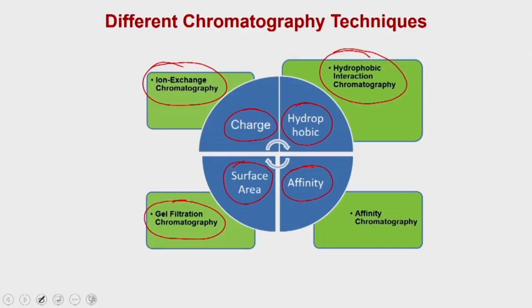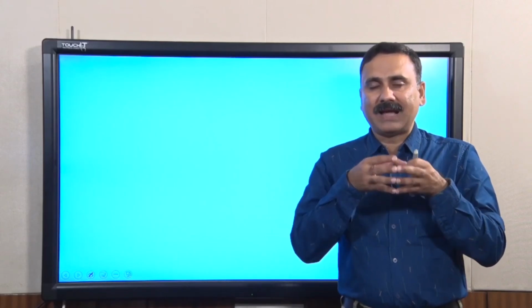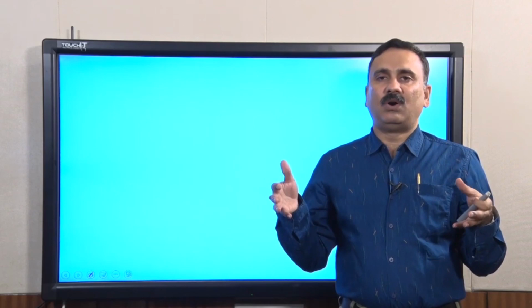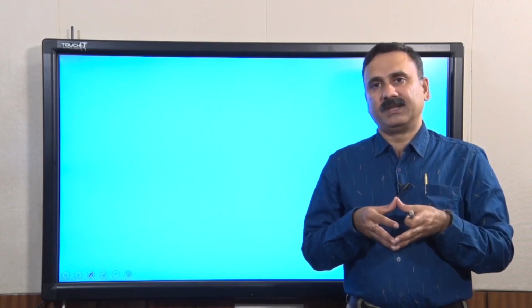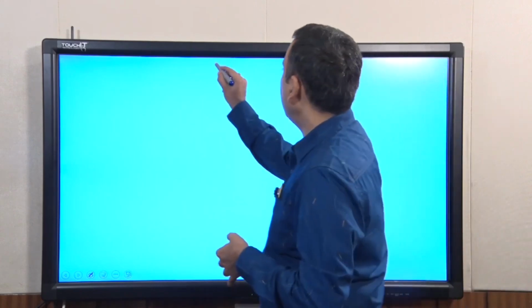Now, let us see how you are going to plan out the protein purification, or how you are going to plan out the purification of this factor from the cells which are overexpressing. So, you start with the cells. The first step is that you are going to break these cells, or destroy the cellular integrity, and that is going to give you the cell lysate.